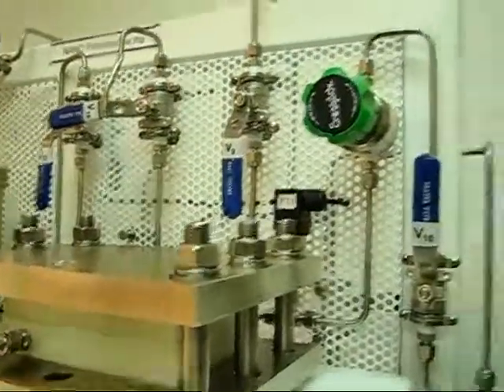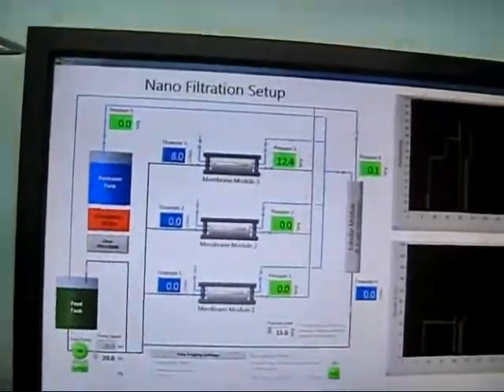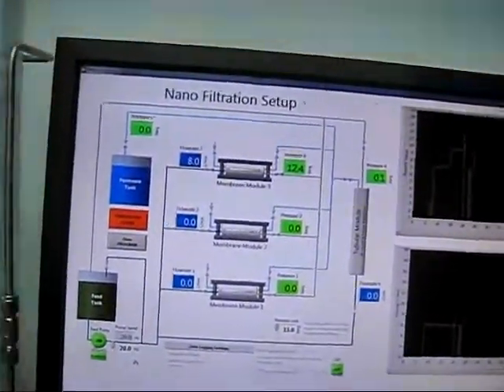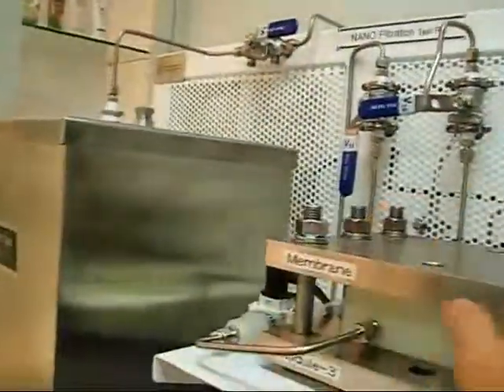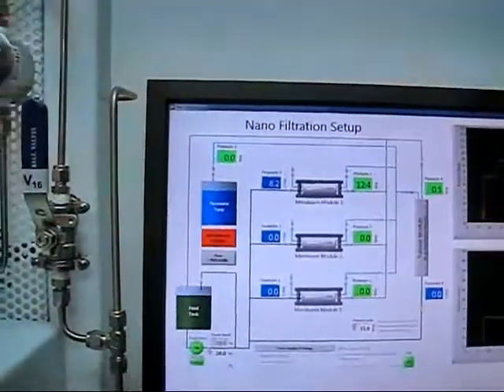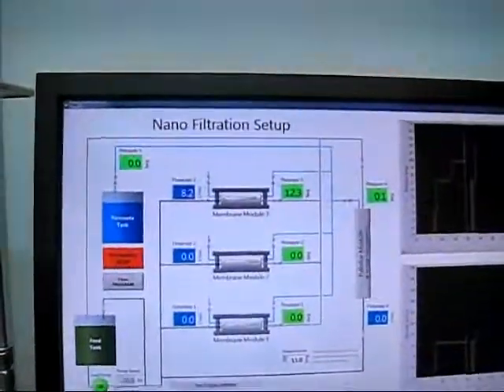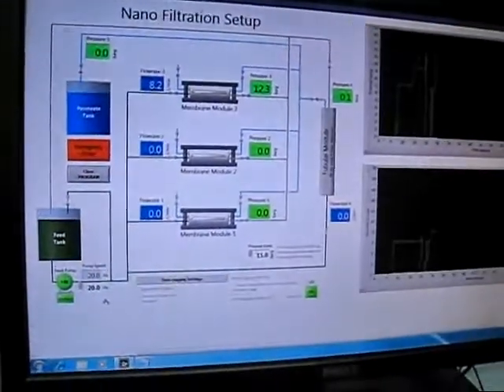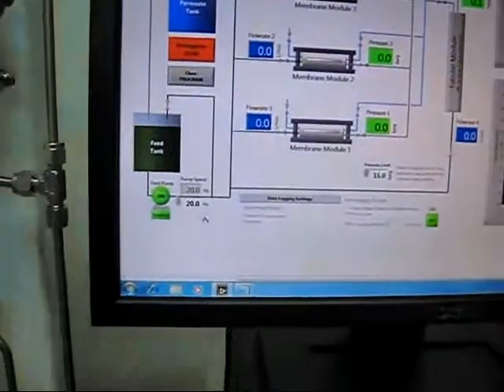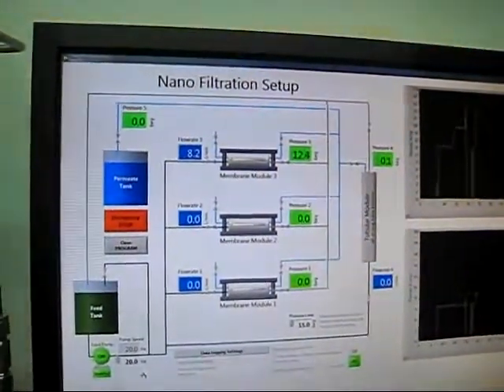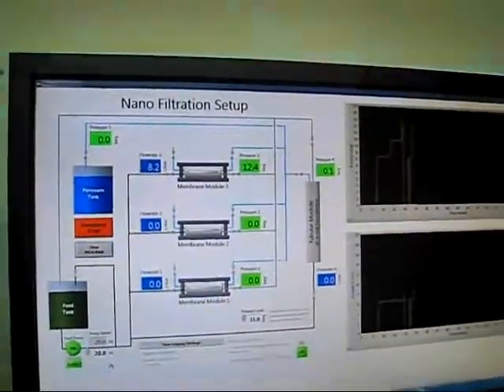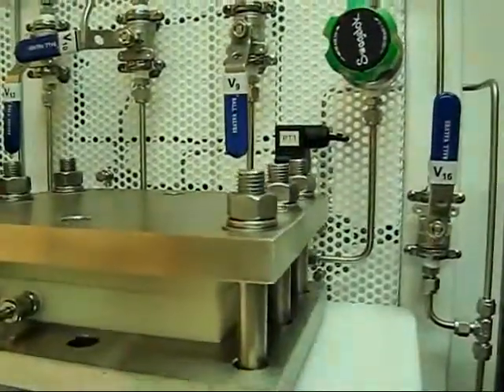The inherent pressure or back pressure of the system is already 12.4—there's nothing much I can do here because flowing through the system is already 12.4 bar. This is 20 Hertz with a flow rate of 8.3 liters per minute and pressure of 12.4 bar on the system. The noise is a bit noisy right now.